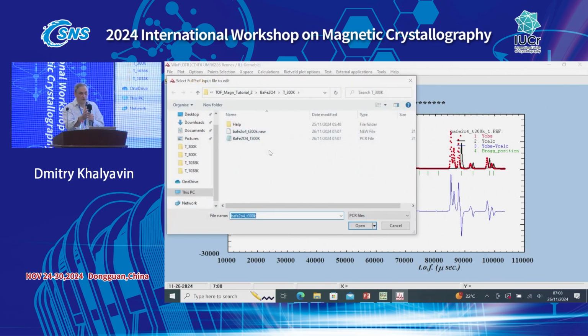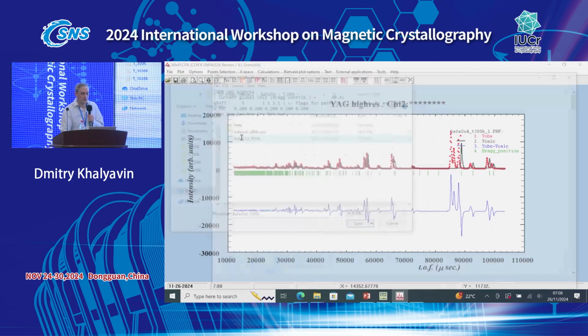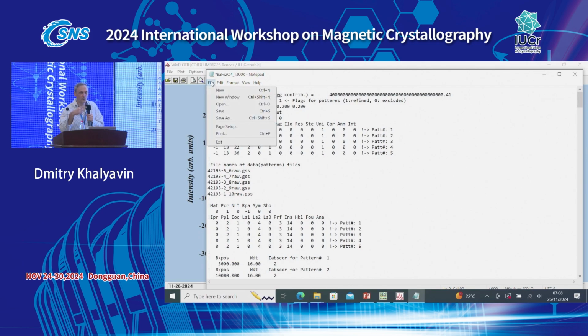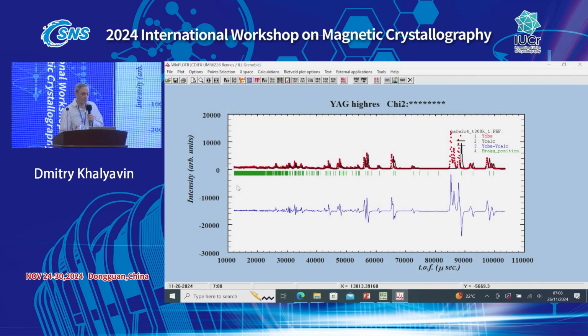We can keep it, or if you want to avoid that, what you need to do, before running, is put a lot of zeros instead of 40 for the chi-square, like that. And if you run it now, it won't complain, it will just rewrite this. But it doesn't matter for us, we're just looking at where we are, and definitely, as we suspected, we are far from it, because our model was collected at very high temperature.